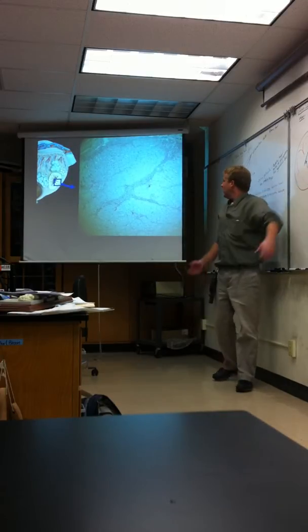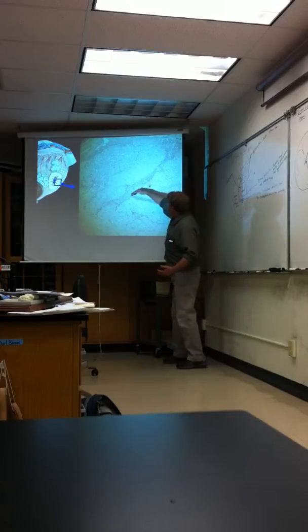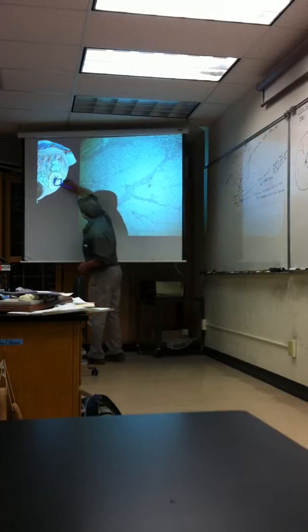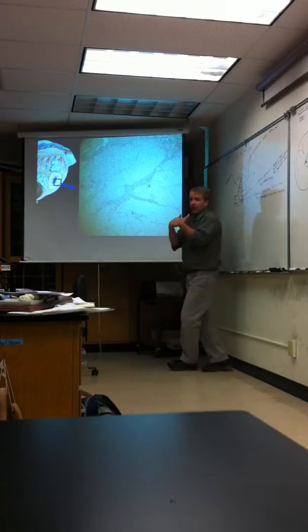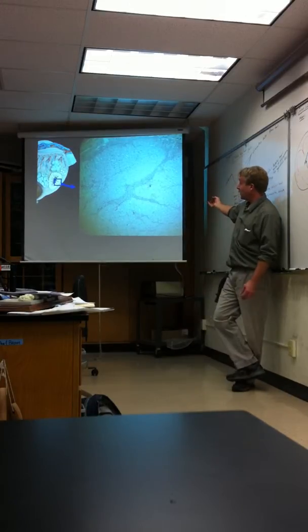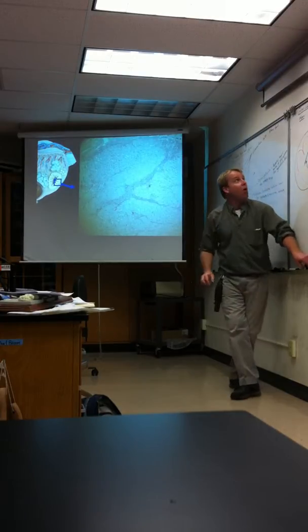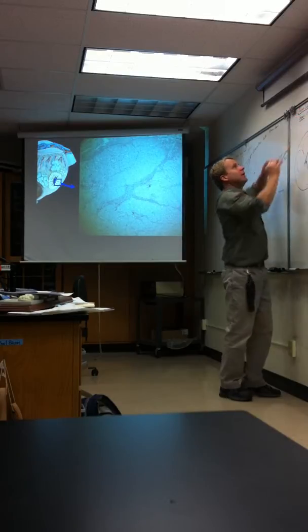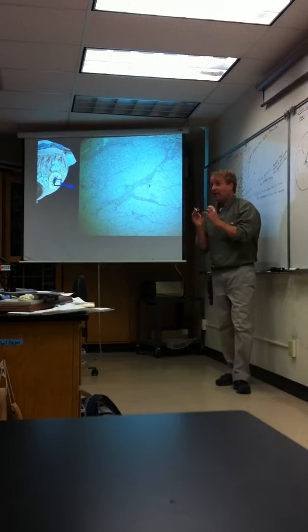When you are looking at this, you can imagine these cells were on the outside of the follicle, and now it's collapsed, and you have these darker cells, and you can see the theca lutein cells would be where those folds are. So questions you could be asked, if you were given this: the specimen is the corpus luteum. That's what it says in the slide. But the organ you already mentioned is the ovary. So you definitely want to recognize, okay, we're looking at the ovary.